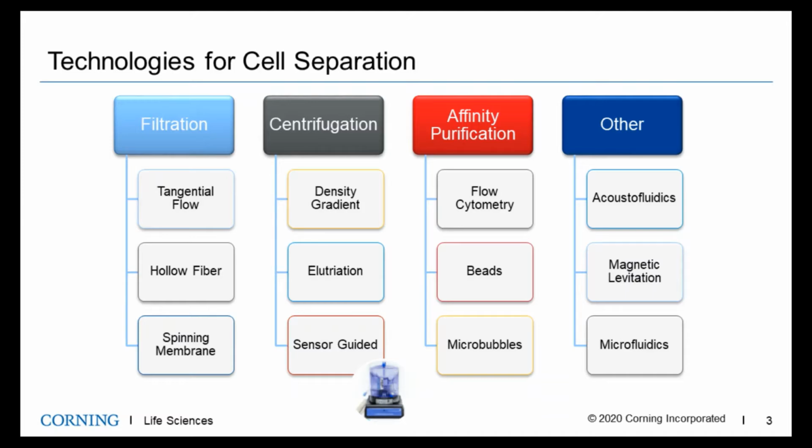If you focus on the first three columns, generally speaking, as you move from left to right, from filtration to affinity purification, and then again looking at the subcategories, what you deal with is trying to strike a balance between the precision with which you can isolate specific cell populations and the batch size that you can process efficiently in terms of things like time, labor, and cost. Another major consideration, especially in the therapeutic space, is the addition of extraneous reagents into this milieu.